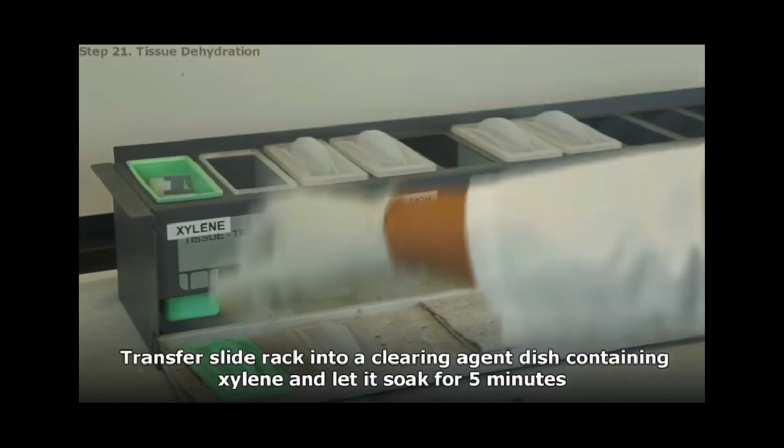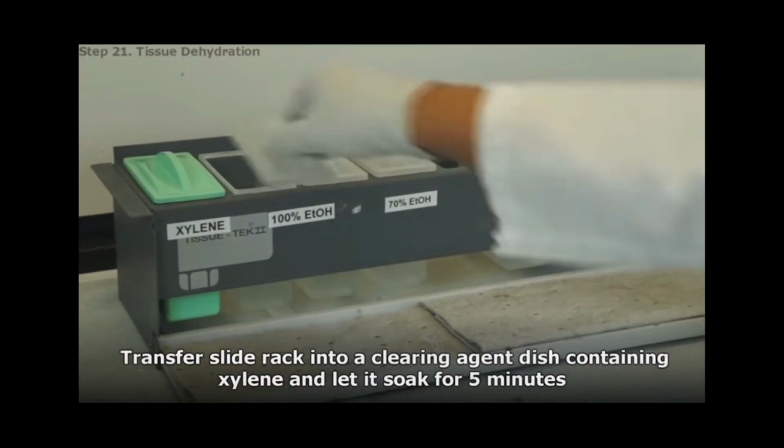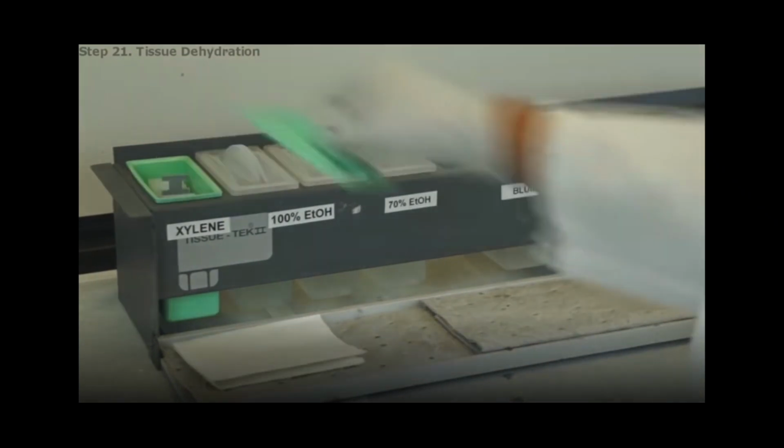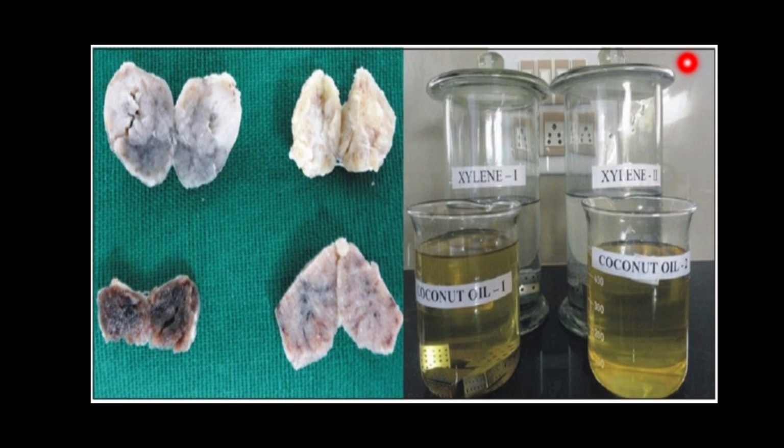Clearing, otherwise known as de-alcoholization, so meaning to remove alcohol. This is the process whereby alcohol or any dehydrating agent, class, is removed from the tissue and replaced with a substance that will dissolve the wax with which the tissue is to be impregnated or the medium on which the tissue is to be mounted.